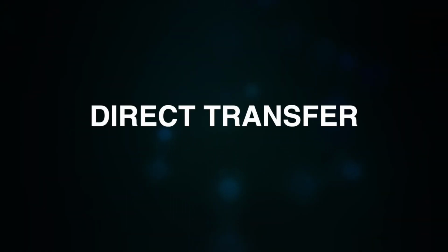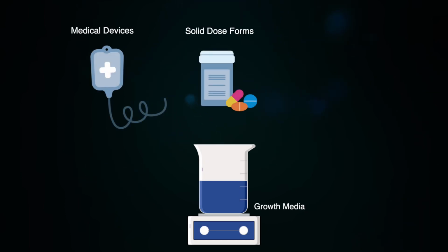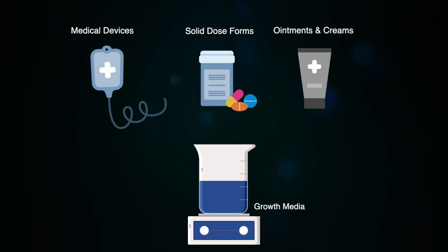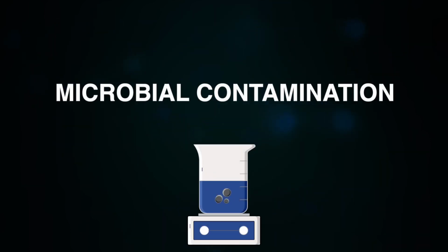Direct transfer is one of the many sterility testing methods that work best for medical devices. Medical devices, solid dose forms, ointments, and creams may be directly immersed in growth media to test for microbial contamination.